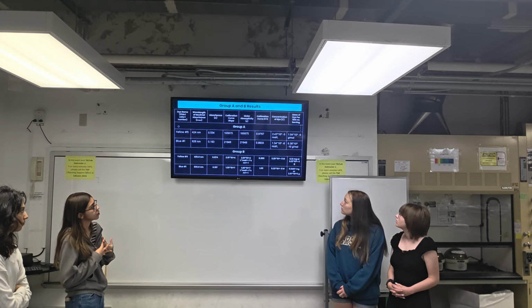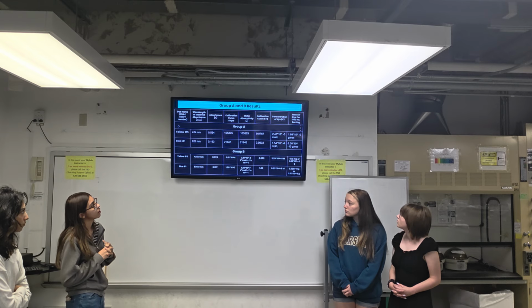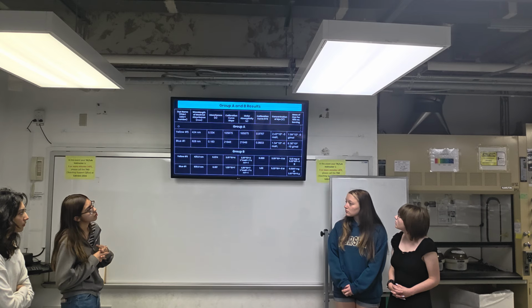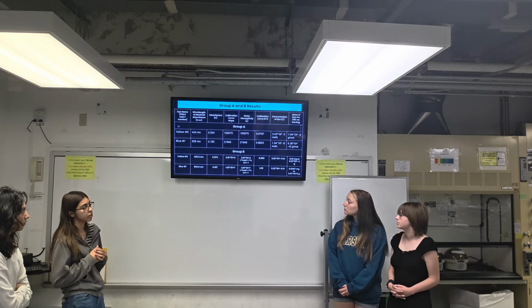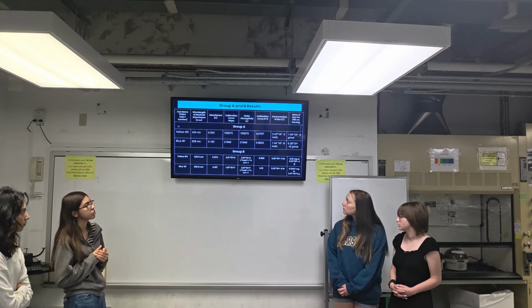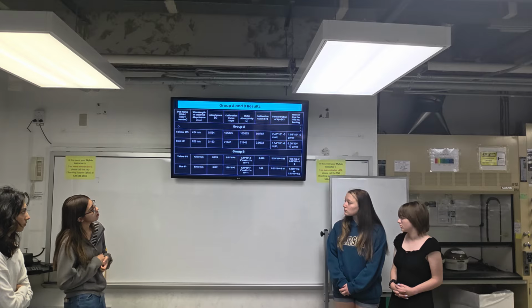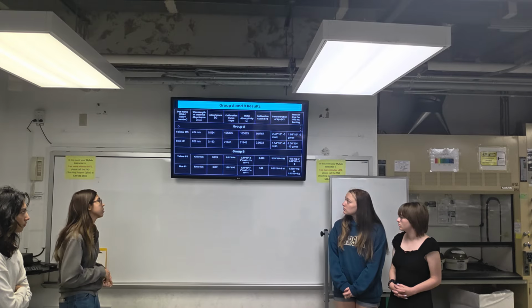The curve R2 was actually pretty similar for both of them. And then the concentration of dye, the yellow dye number 5 was similar, but the blue dye number 1 was pretty different. And then the mass was also pretty different for both.